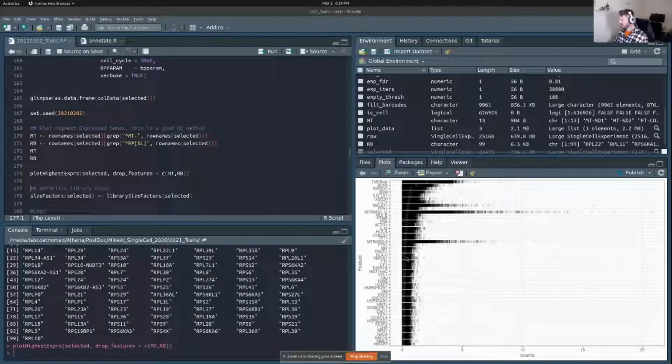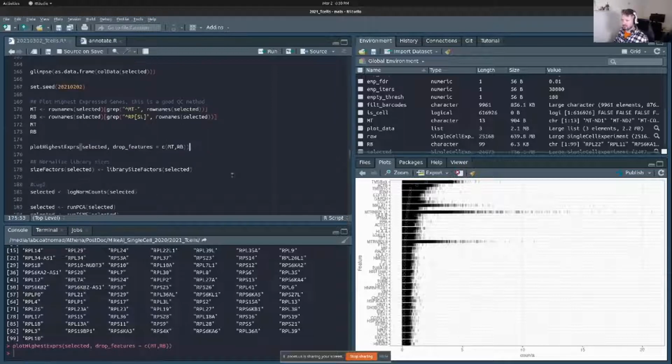Okay, so our plot's loaded. It's going to be kind of blurry, but we're looking at this. Can we see the kind of genes that we expect to see? We're seeing HLA genes. That's good. We're seeing granzyme genes, so we have cytotoxic cells. Good. We expect that in our T cells. Interleukins, IL-32. So this gives you the idea, oh yeah, this is what we expect to see in our cells. Nothing here is shouting out that it's too crazy.